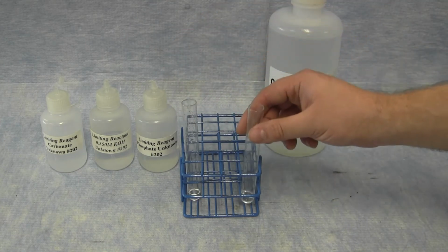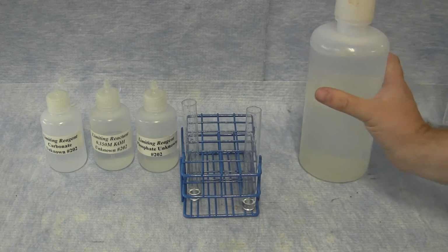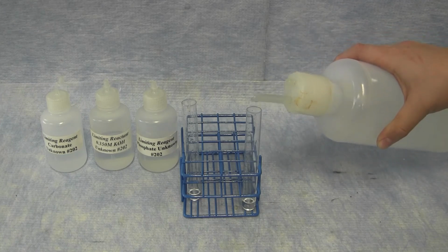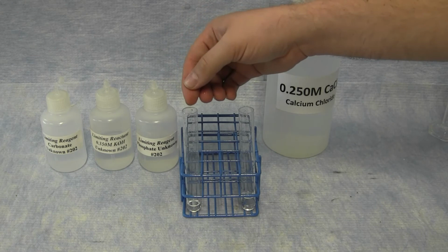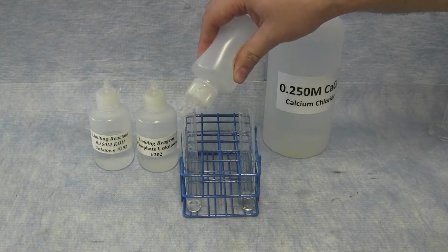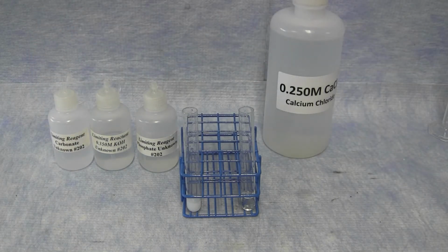To one of the test tubes, you will add a small amount of additional calcium chloride. And to the other test tube, you will add additional amount of your particular unknown. Based on the reactions, you can determine what was the limiting reactant in that first combination.